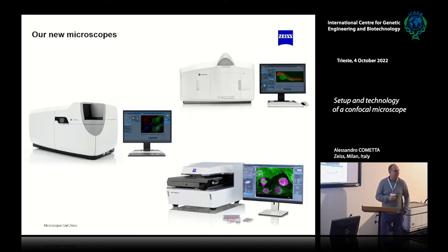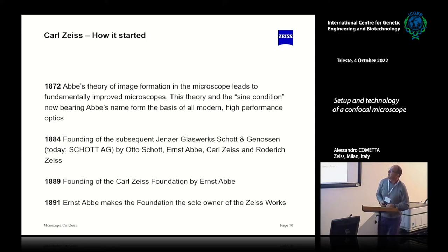Now the microscopes are quite different, so there are no more eyepieces. These are the last three microscopes produced by Zeiss. There are no more eyepieces. We just use screens or even a 3D viewer. And things have changed a little bit. So now I would like to explore with you how it started and what we have done.